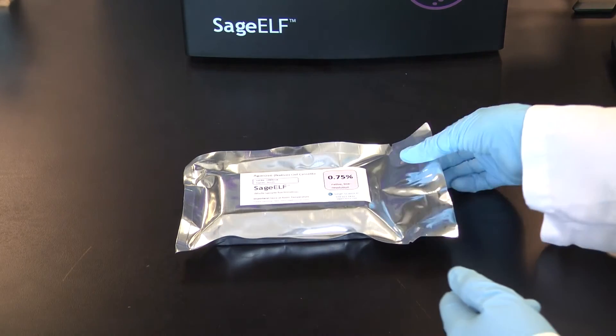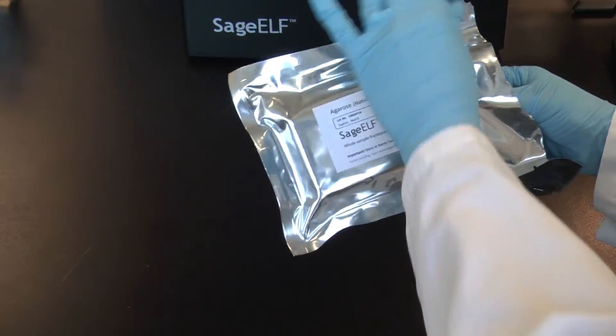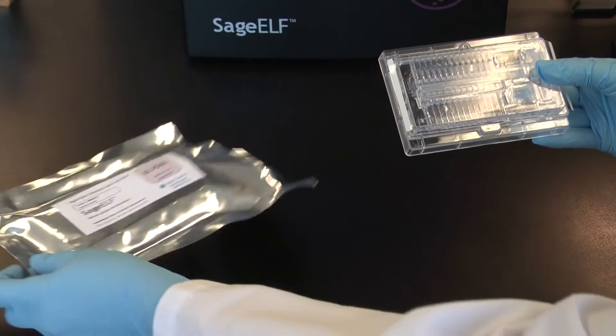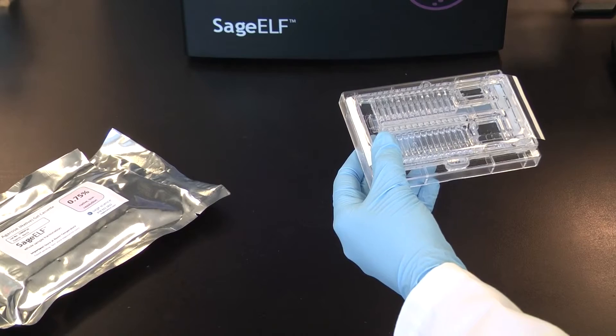To prepare a cassette, remove the cassette from the foil bag. While still taped closed, hold the cassette sideways with the elution well side down.